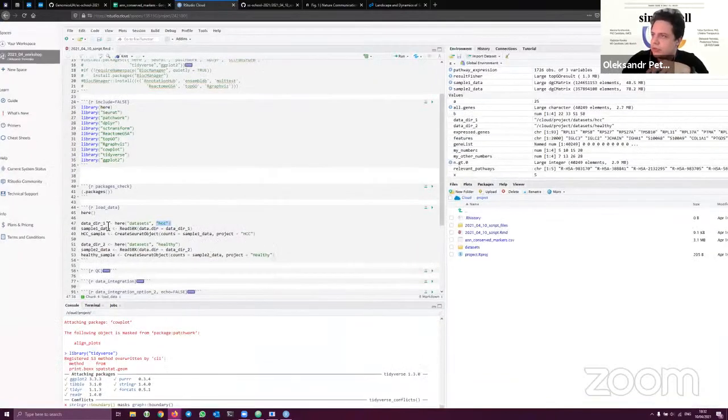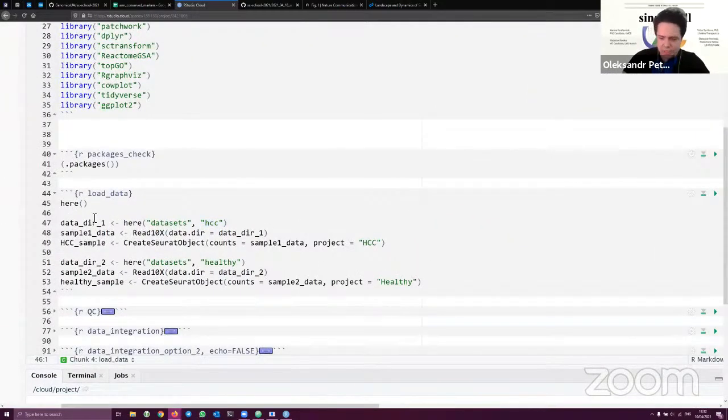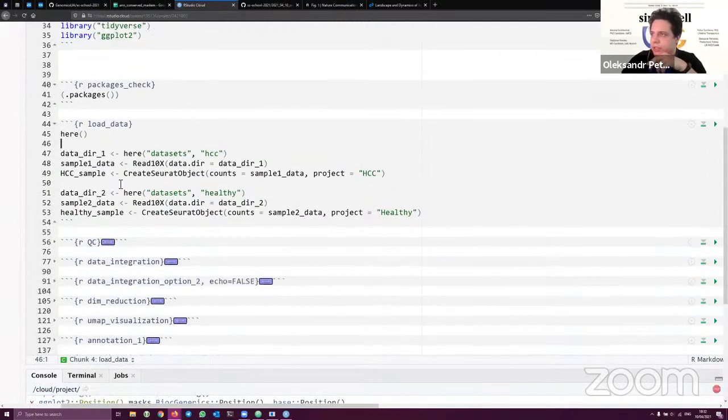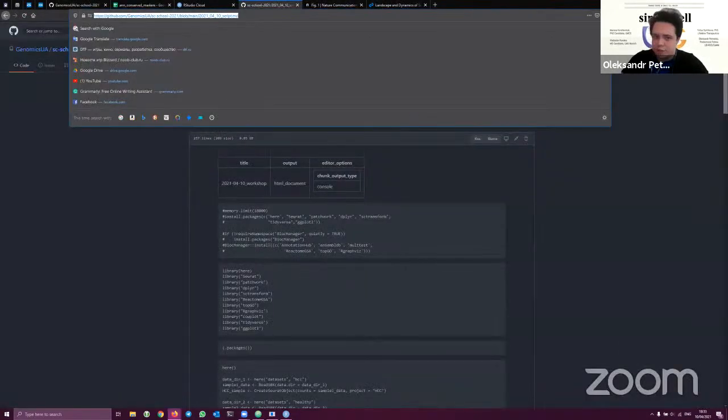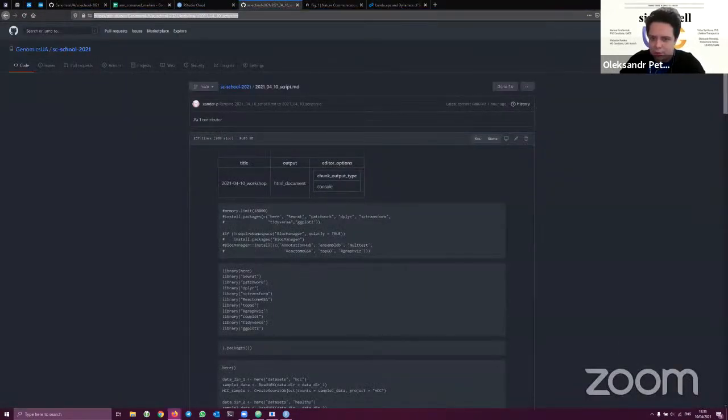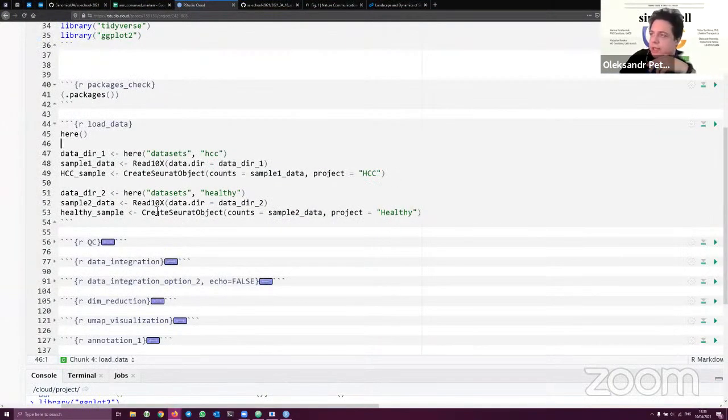Nevertheless, we'll execute this chunk right now, and I will explain what it does. Ctrl-Shift-Enter on the chunk, which you also should copy-paste. Somebody asked on the workshop channel how to find this code. I wrote a few times, it's provided on the GitHub repo, and I copy once again the link. Please just copy-paste the chunks from there, and we will proceed with this code to be copy-pasted.